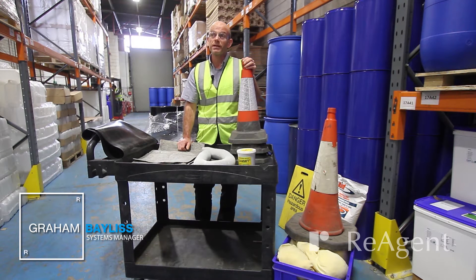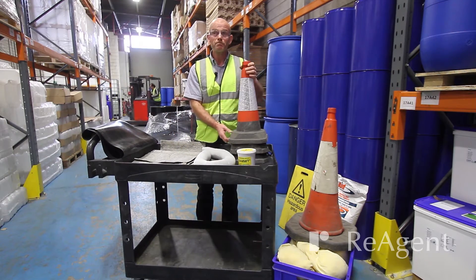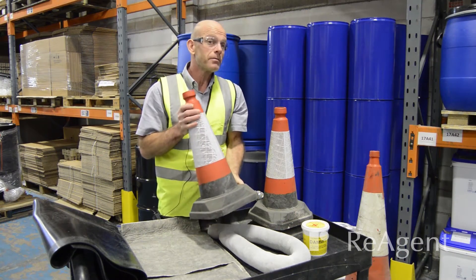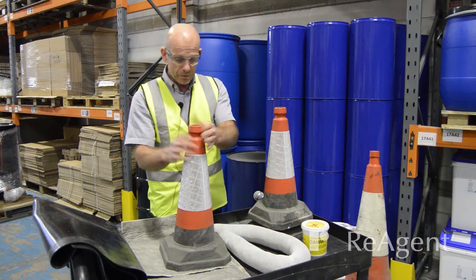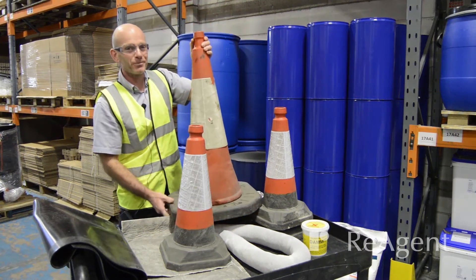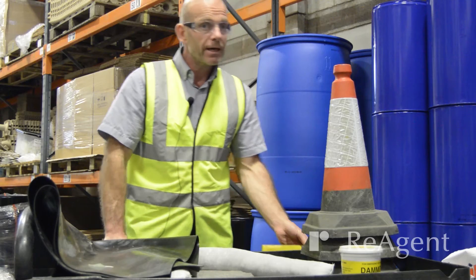The first thing is the cones. These are pretty obvious — they're for creating a barrier. You put these on the floor to cordon off any spillages and stop any unwanted personnel from entering the spillage area. We've got small ones here, and also this larger object if we need something a bit more serious, so there's a variety of things we can use.